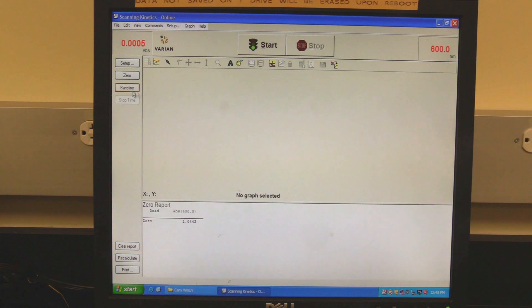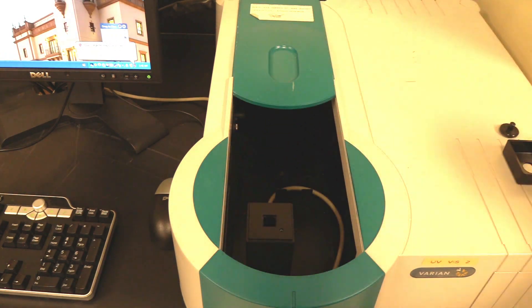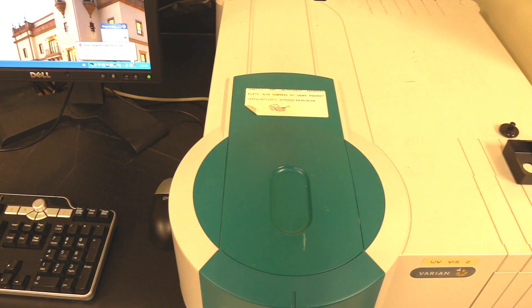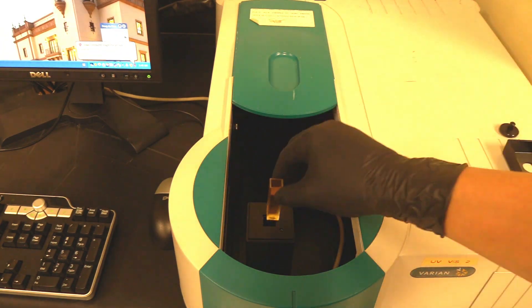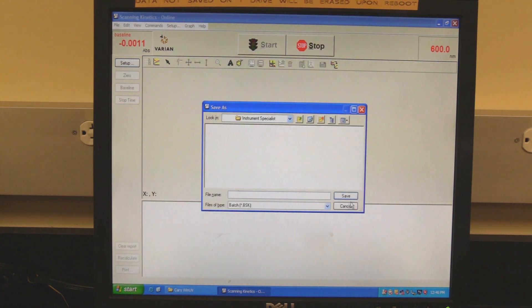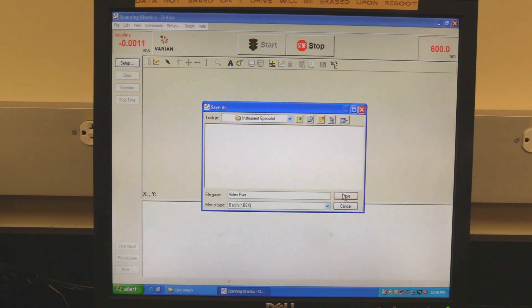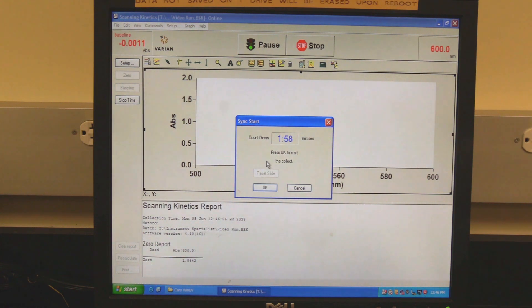Click on the baseline button. The software will prompt for the operator to insert the blank cuvette. Insert the blank cuvette in the sample chamber as demonstrated in wavelength scan measurement. Click on OK to make the baseline measurement. Wait for the measurement to finish. Insert the sample cuvette in the sample chamber as demonstrated in wavelength scan measurement. Click on the start button. If save at start was selected, then the software will prompt the operator to save as shown in the video. Find the appropriate folder, name the file, and click on save. The software will prompt for the sample name. Click OK. The countdown timer will appear. Add the reaction reagents to the cuvette in the sample chamber and click OK.